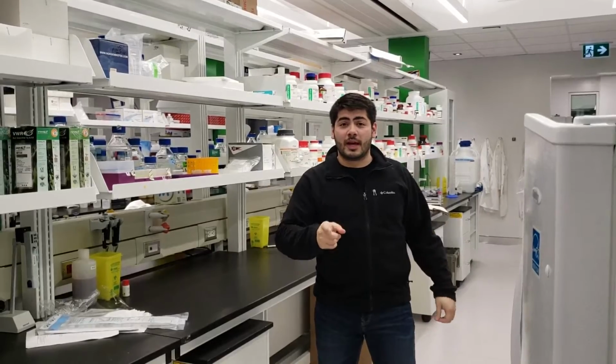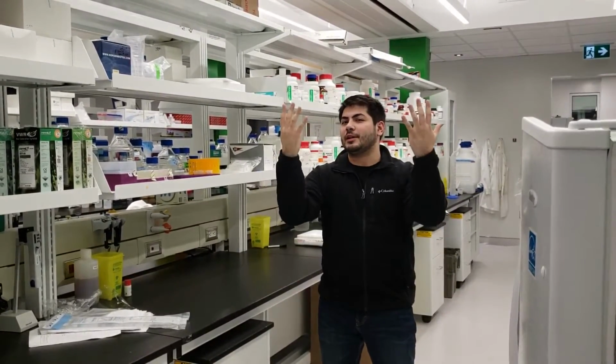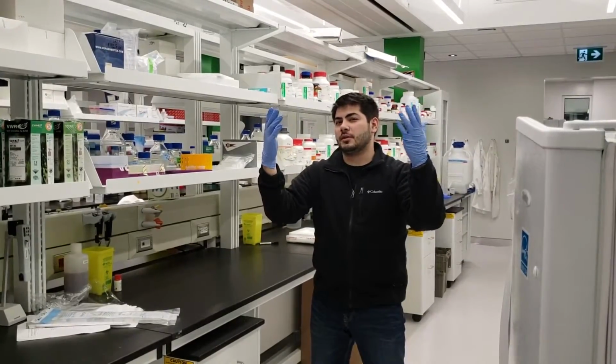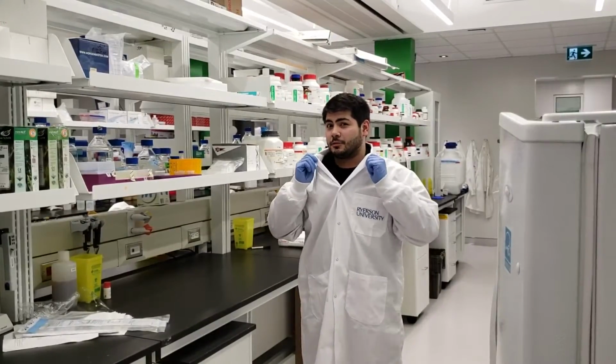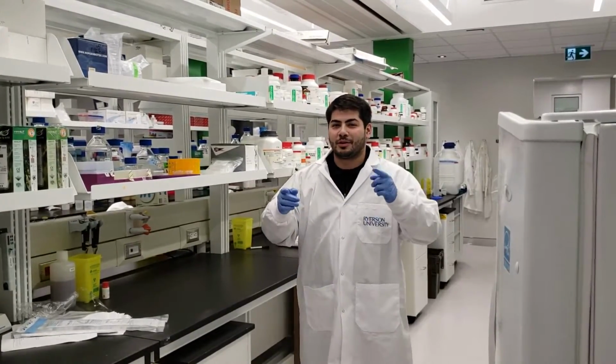Alright, now that we're in the lab, first things first, we have to get our safety equipment on. That means gloves. Now that we have our gloves, we're going to need our lab coat. Lab coat done all the way up. Last thing is, that's right, eye protection.